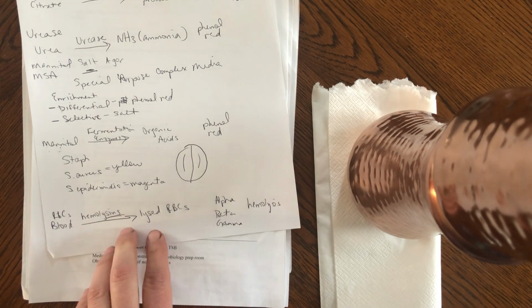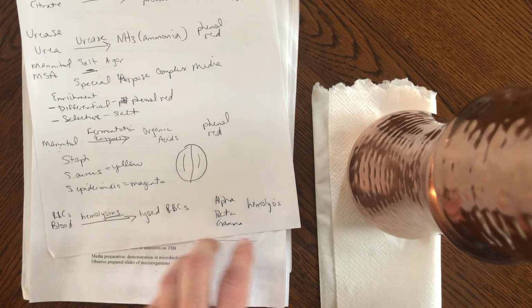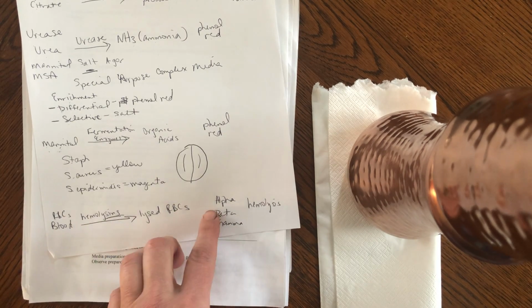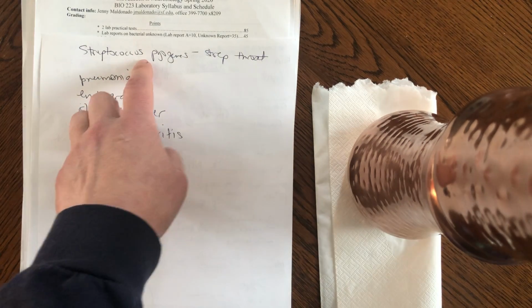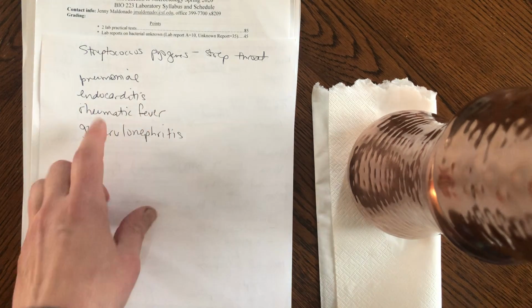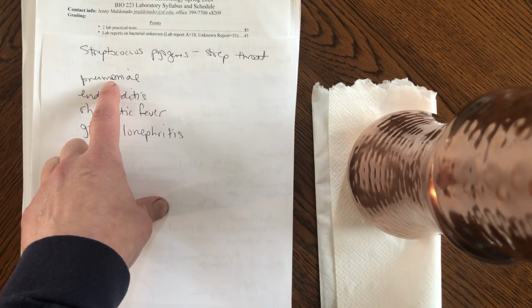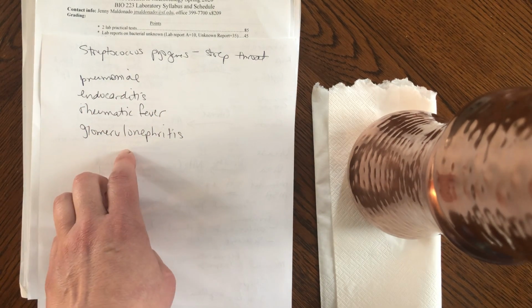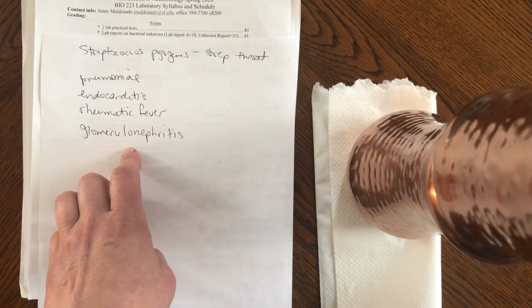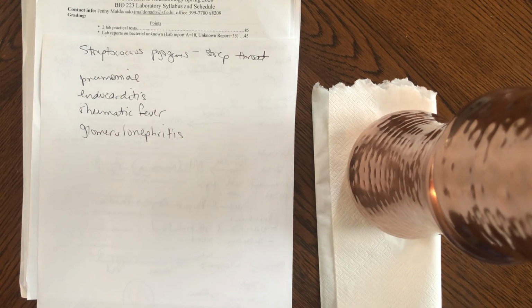So for this blood agar, again, you've got to know the difference between alpha, beta, and gamma hemolysis. You need to know the chemistry behind it. You also need to know that Strep pyogenes is the bacteria implicated in strep throat. And if you don't get strep throat taken care of, these are the four secondary sequelae or infections that you can get as a result of an untreated or improperly treated strep infection.